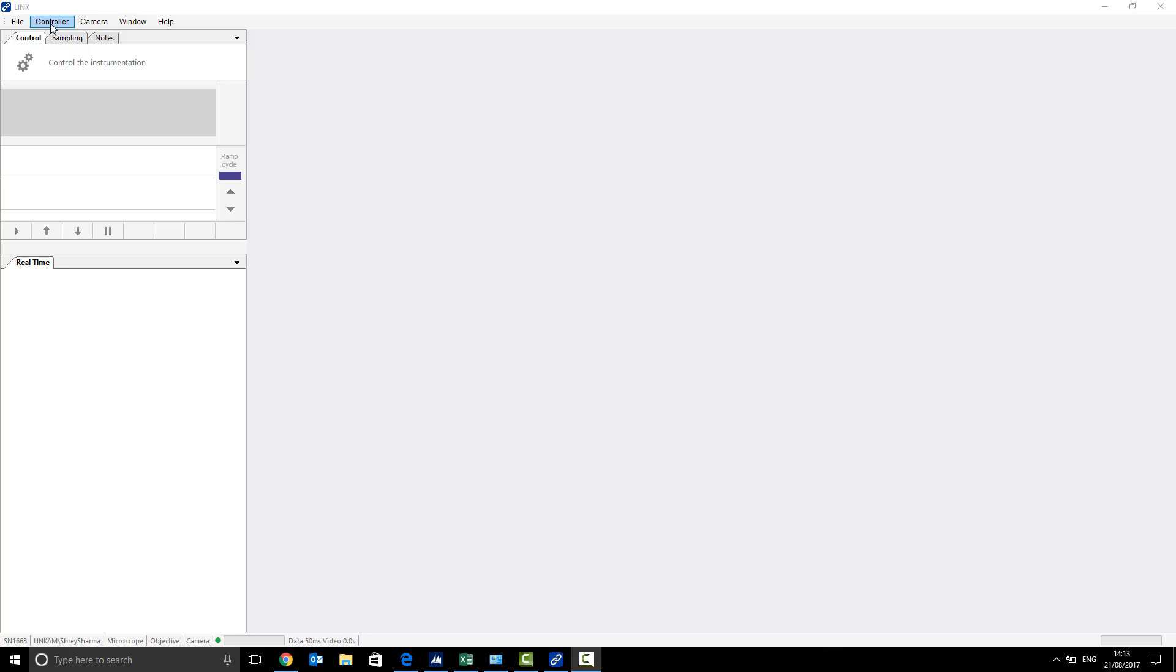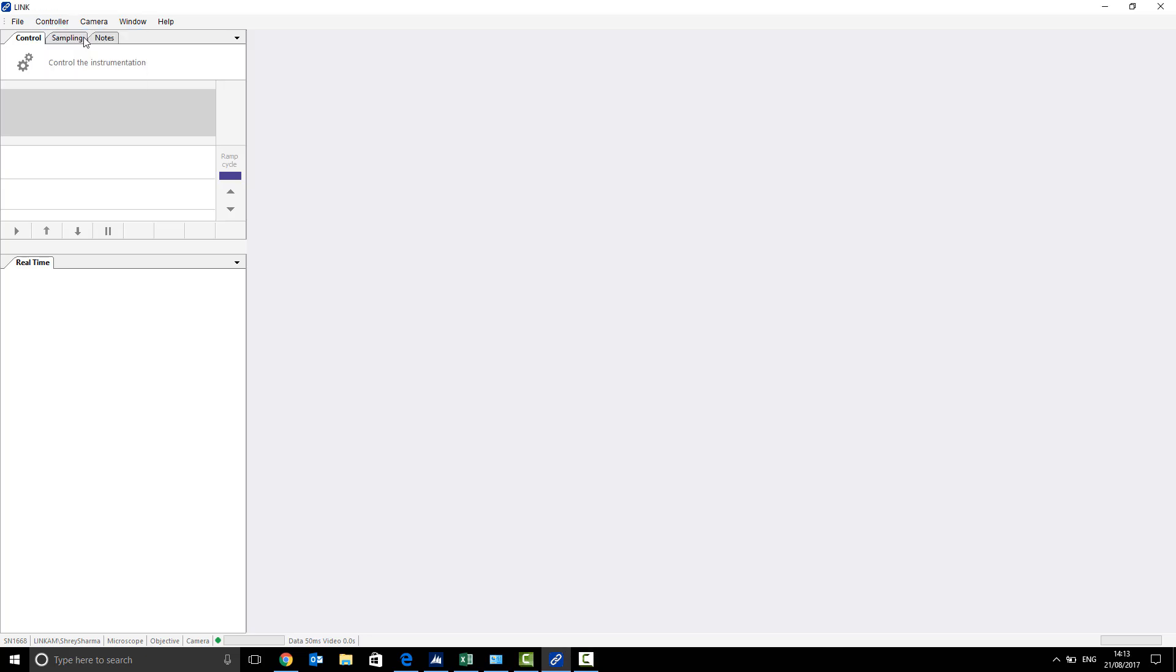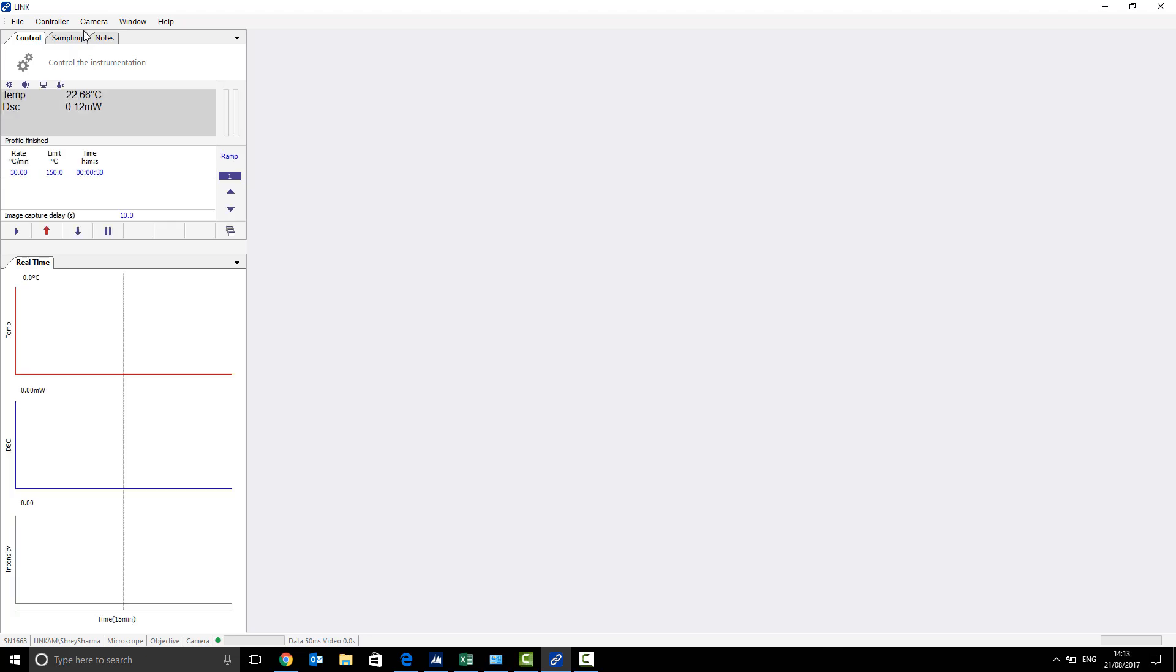Firstly, you will want to go to the controller tab and select connect. This will bring up your ramps and some DSC information over here, such as temperature.